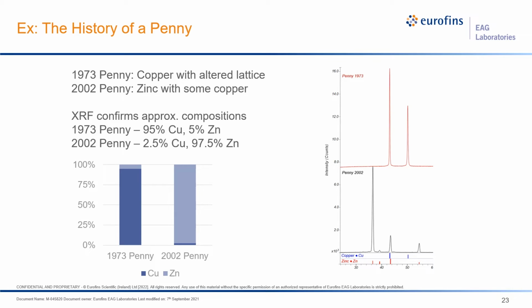Before 1982, pennies were made of an alloy that was mostly copper, but did contain some amount of zinc. However, as the value of American currency changed, the US government decided to save money while making it, so they switched to a penny that was made of zinc but plated on the outside in copper. The X-rays will penetrate through the copper plating into the zinc that makes up the bulk of the penny, so we get signal from both. In today's money, that 1973 penny would be worth almost triple what it originally was, which still isn't a whole lot.